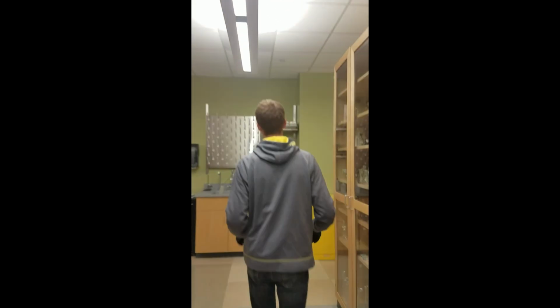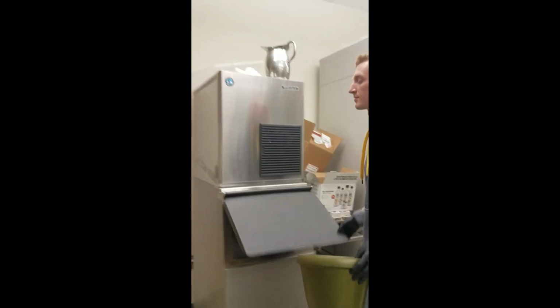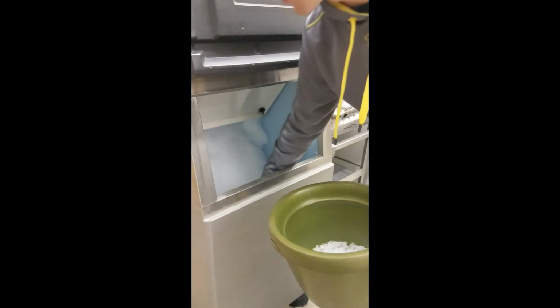And now we're going to go get the RNA. You want a bucket that we're going to fill with ice. When you're transporting the RNA, always transport it in ice so that it stays cool and doesn't get degraded by the temperature.